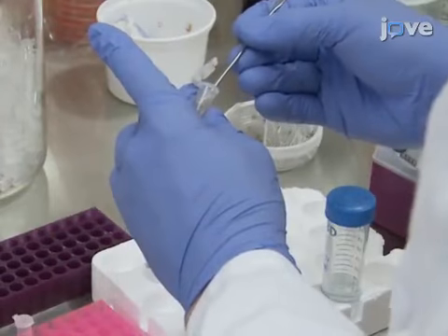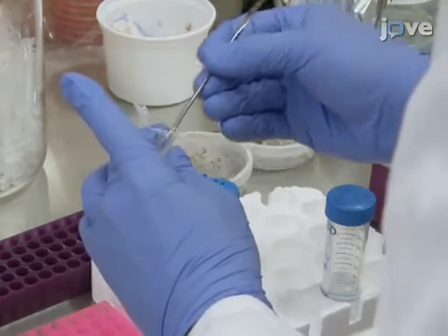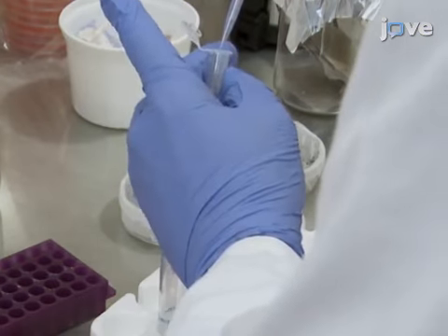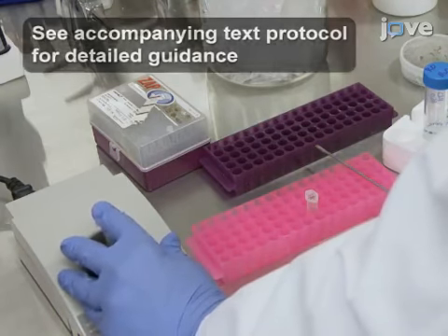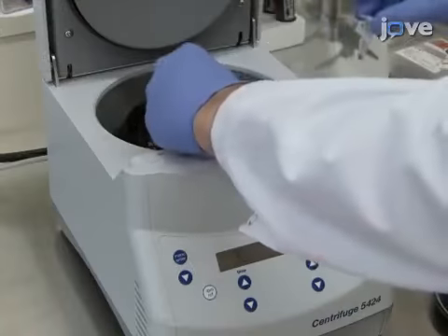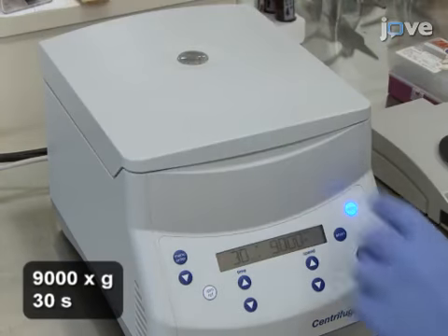To begin the experiment, seeds must be sterilized. For Arabidopsis thaliana, combine approximately 200 seeds with 500 microliters of deionized water in a microcentrifuge tube and vortex the tube at high speed. Centrifuge the tube at 9,000 times G for 30 seconds in a tabletop microcentrifuge.